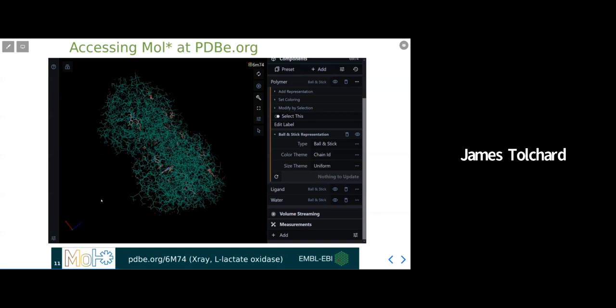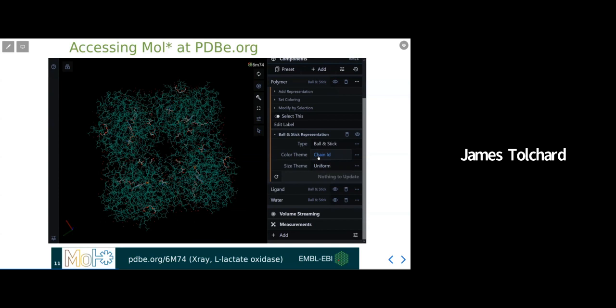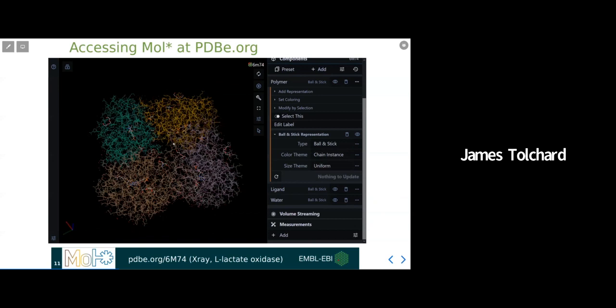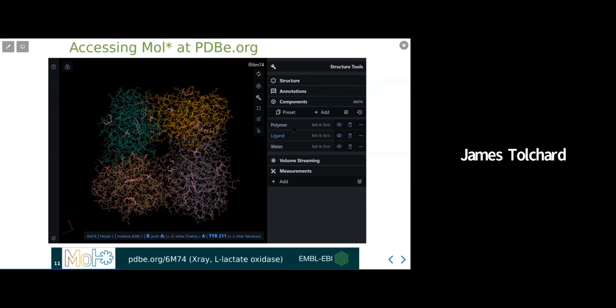As for colors, you can choose from many predefined color themes, which reflect different biophysical or structural parameters. And just quickly as an example, this is how easy it is to change the coloring to, for example, distinguish individual chains. All of these representation options also apply to other components, in this instance, ligands and waters.